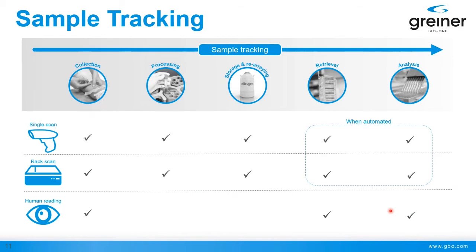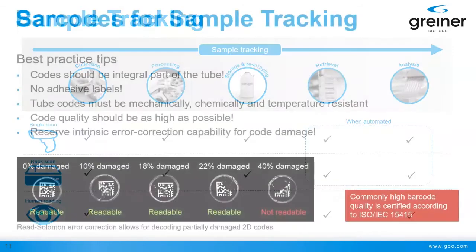The example I usually make is, let's assume you have a very nice biobank, you have a web page where one can access your database, and there are very interesting samples, and there's a researcher working on a certain topic requesting 3 of these samples somewhere in the world. They get them shipped and they get paperwork with it, but these people usually don't have single tube or rack scanners or whatever to really cross-check if really the right samples with the right paperwork were shipped, but they have their eyes, which they can always use. So the human readable function may at least become important at this very end of the workflow.